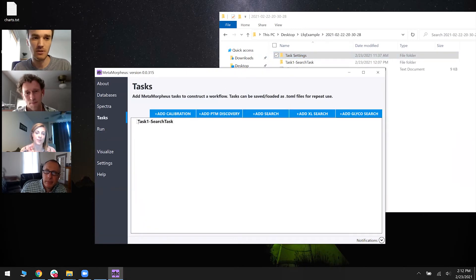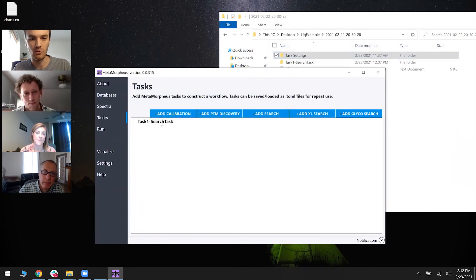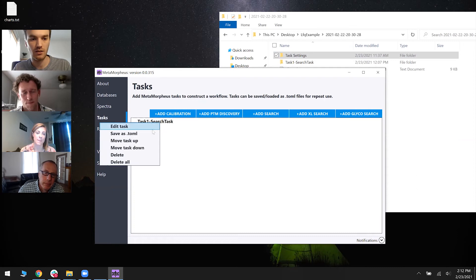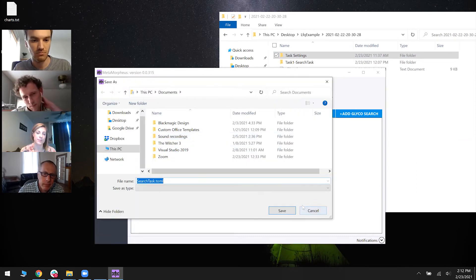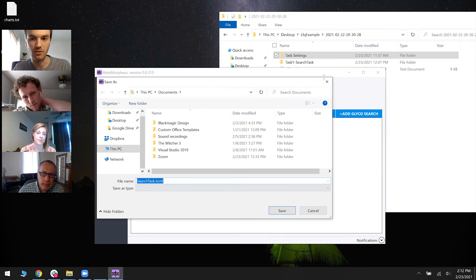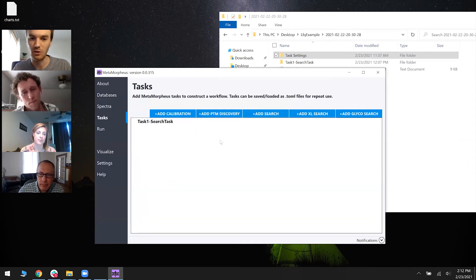Another option, if you don't want to run it, you can right click and click save as TOML and it'll give you a path. You can save it wherever you want.